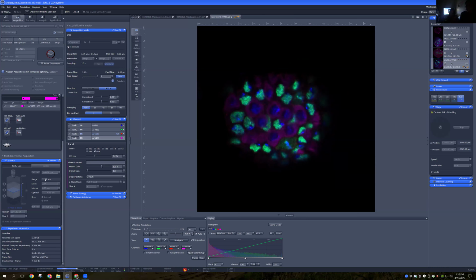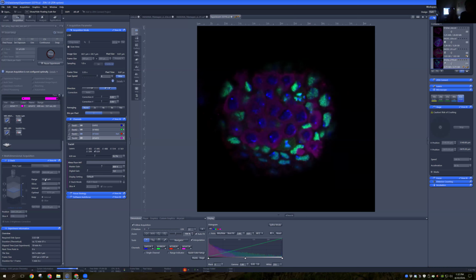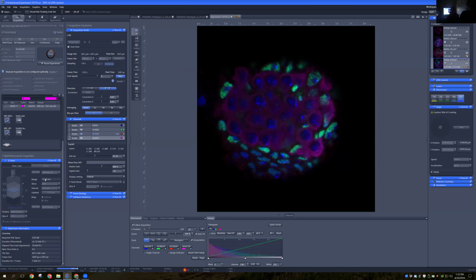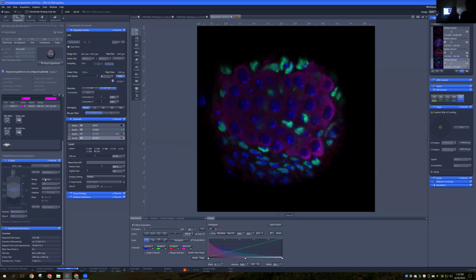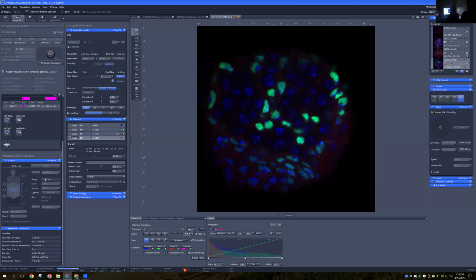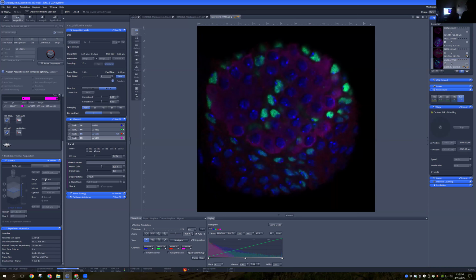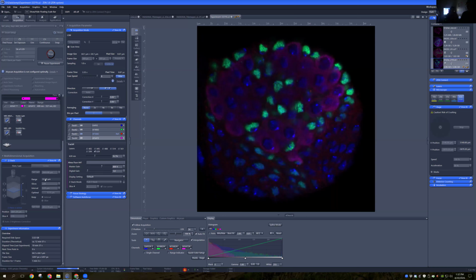Well, it's so fantastic, it's so nice to meet you, Ria, and to have someone on the Zoom who knows these flies kind of personally. The role of diet and nutrition in the germ stem cell, those are always super interesting papers to read. I really like those, so that's really cool. In terms of learning the larval dissections, when I joined the lab, there actually was no one who did the protocol.